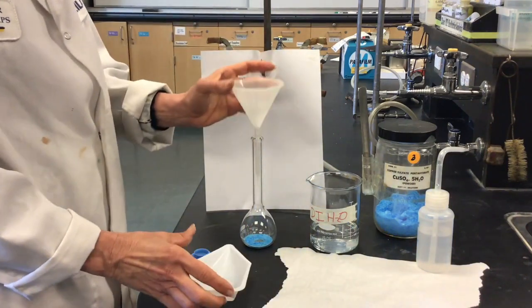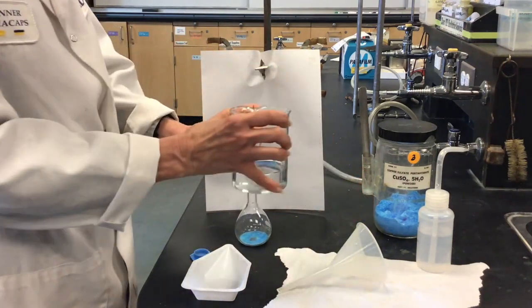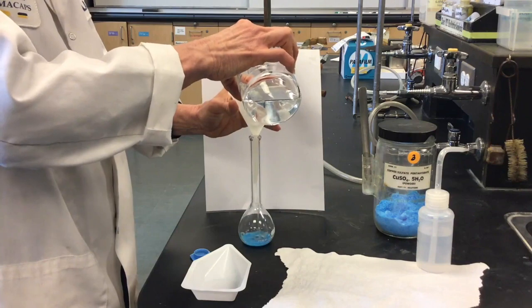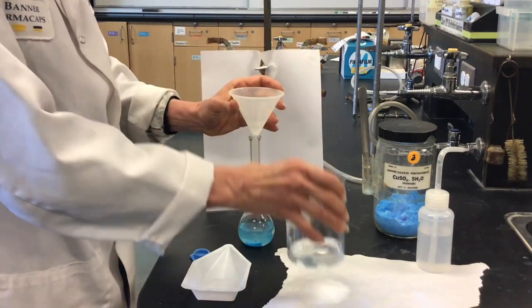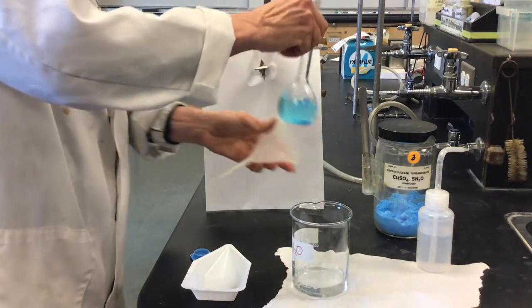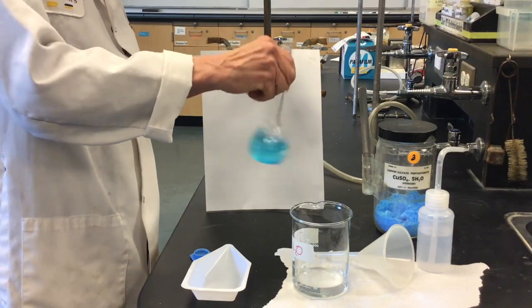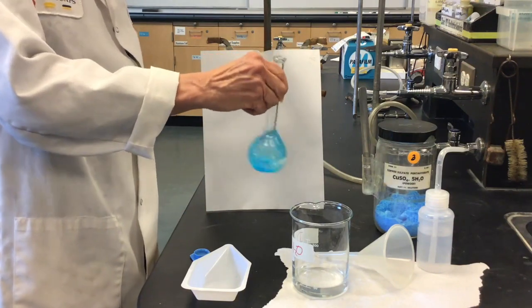And then to make our aqueous solution, we need to add our deionized water. As I said, our total volume is 100 mLs here. So usually what I do is I fill the flask about halfway so it's easier to mix, and then I swirl it to mix what I have in here. And once that's dissolved, then I'll fill up the water so that it goes to the mark on my volumetric flask.